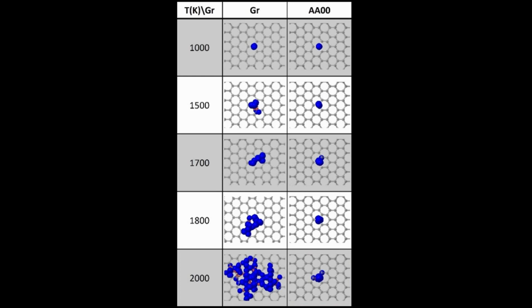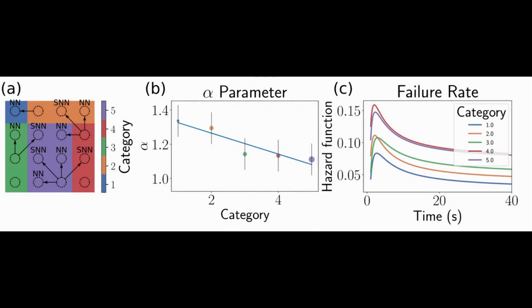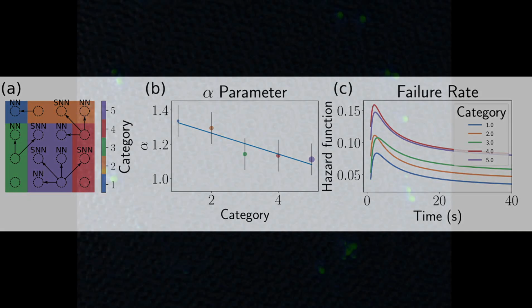This is not to say that no vacancy diffusion occurs. Indeed, if we perform an analysis of different positions within the arrays, we find that the more neighbors a position has, the faster we obtain an outcome. This is easily understood by invoking the effects of vacancy diffusion.